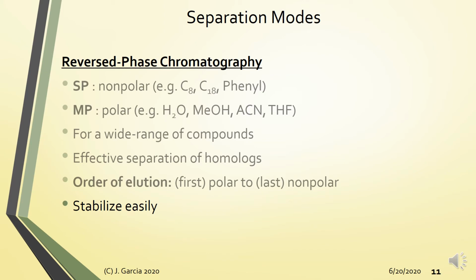Vice versa, when you're done with the analysis for the day, you need to wash the column. In washing, you just do the reverse order of conditioning. From the mobile phase, you wash it with pure water. It's a very important step, especially when you use a mobile phase containing buffers or ion pairing agents, because you want to ensure that any residual salts inside the column are washed away before you fill the column with the storage solvent, to prevent the salting out we mentioned.